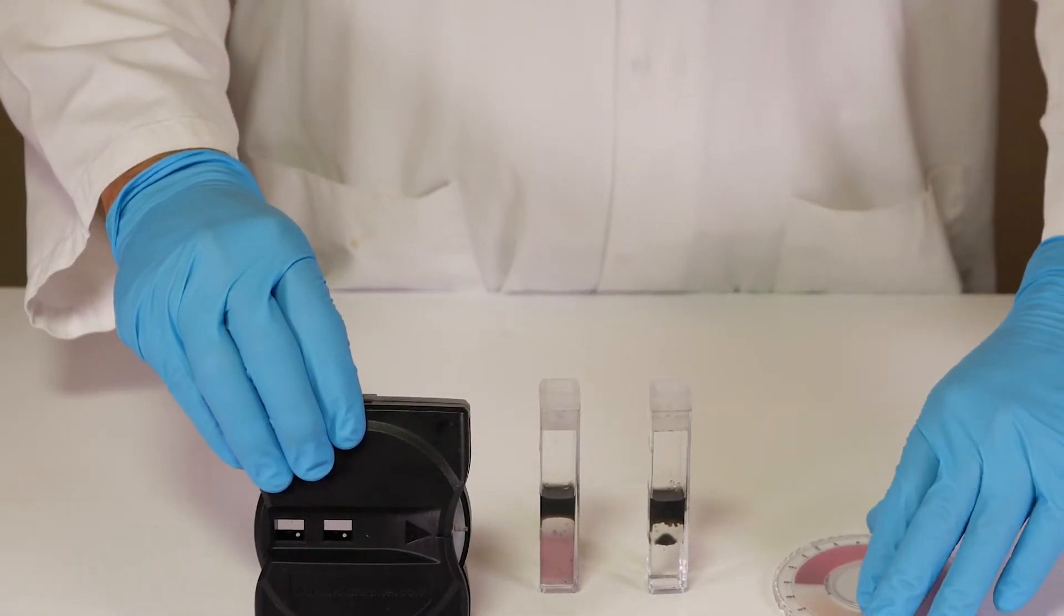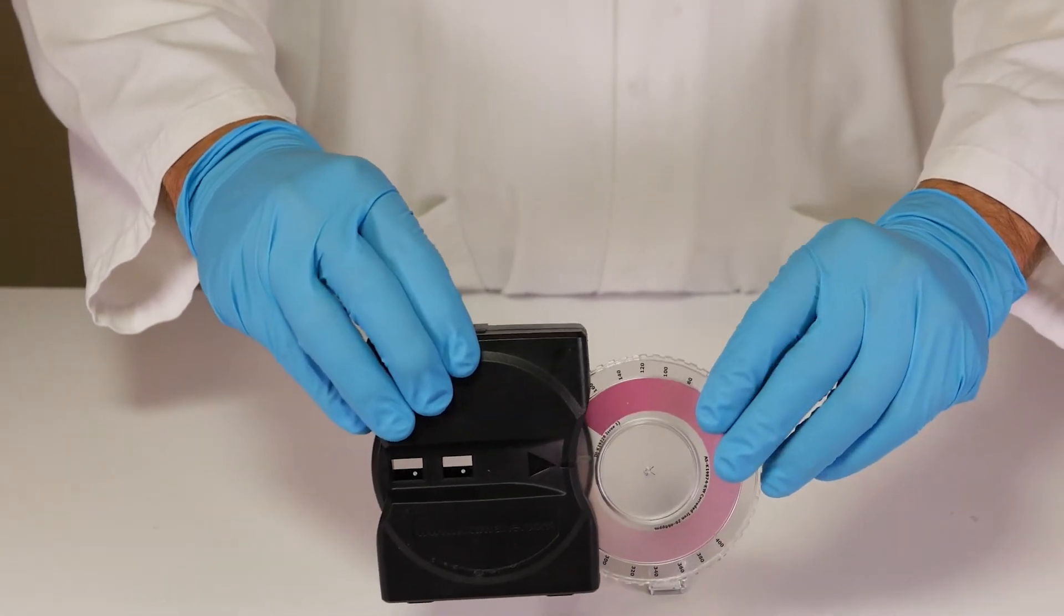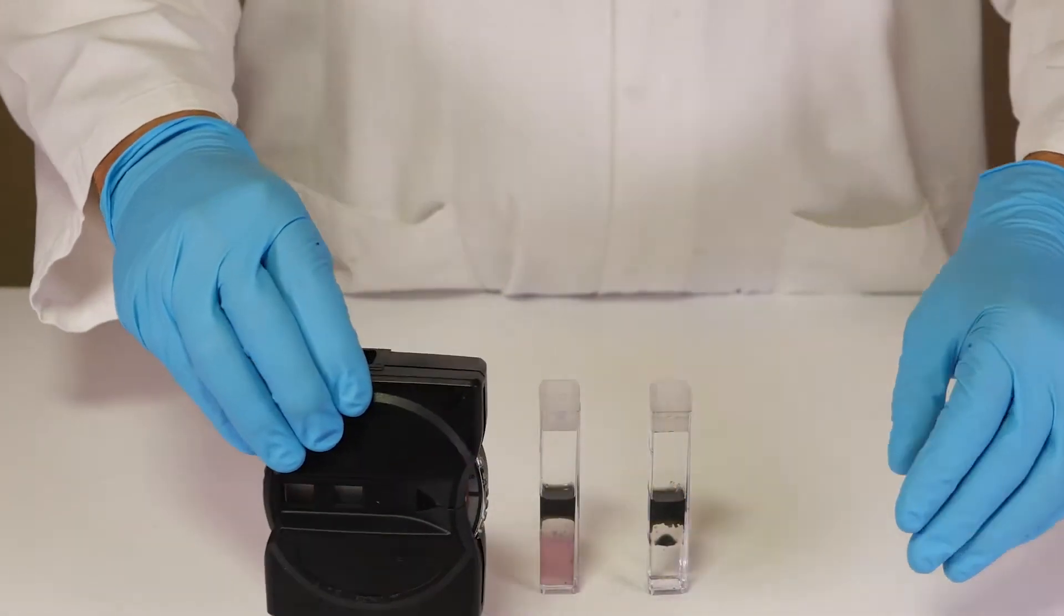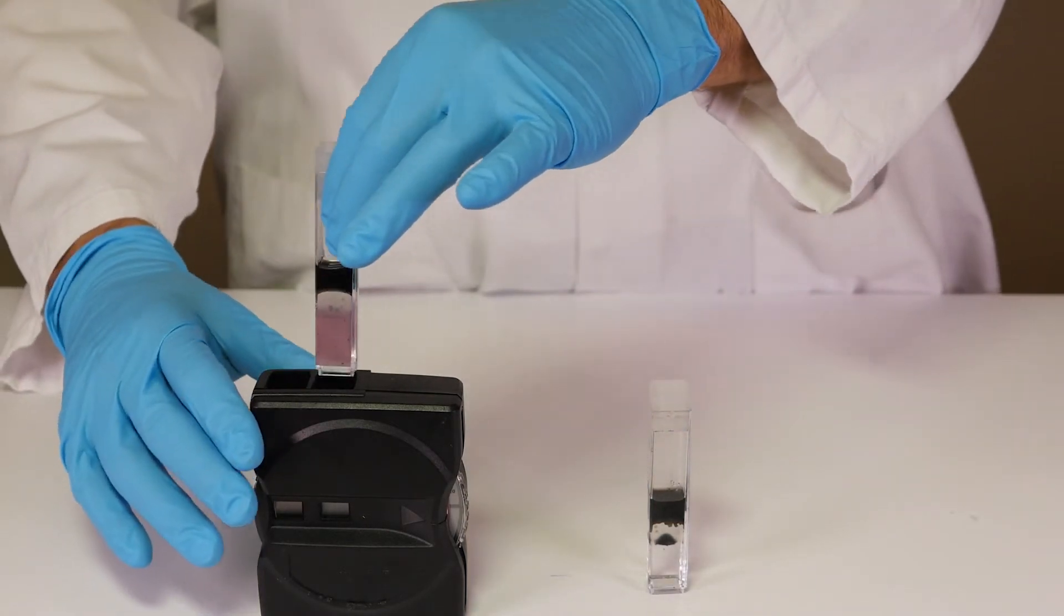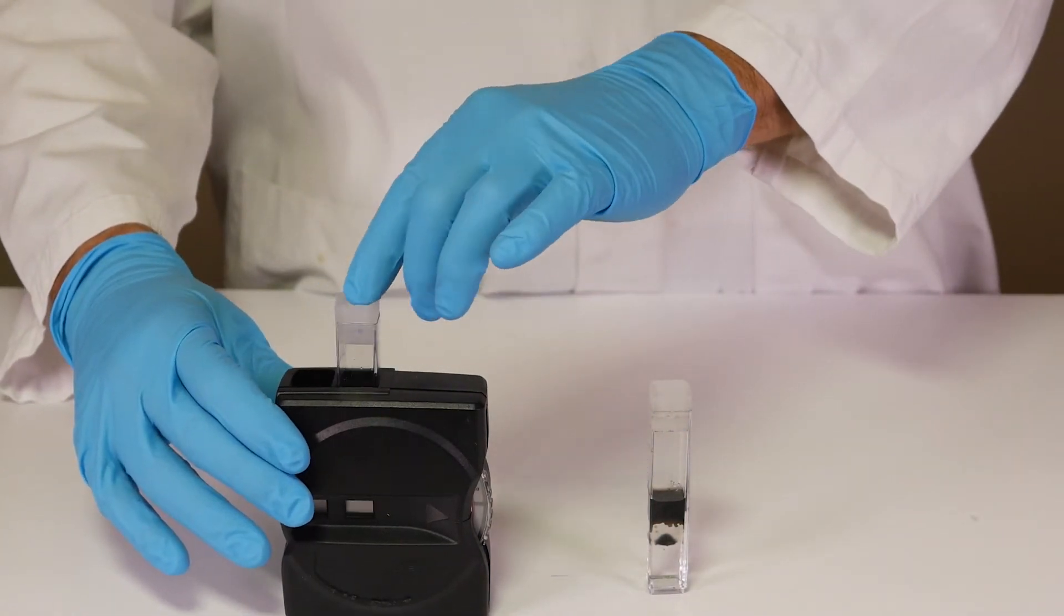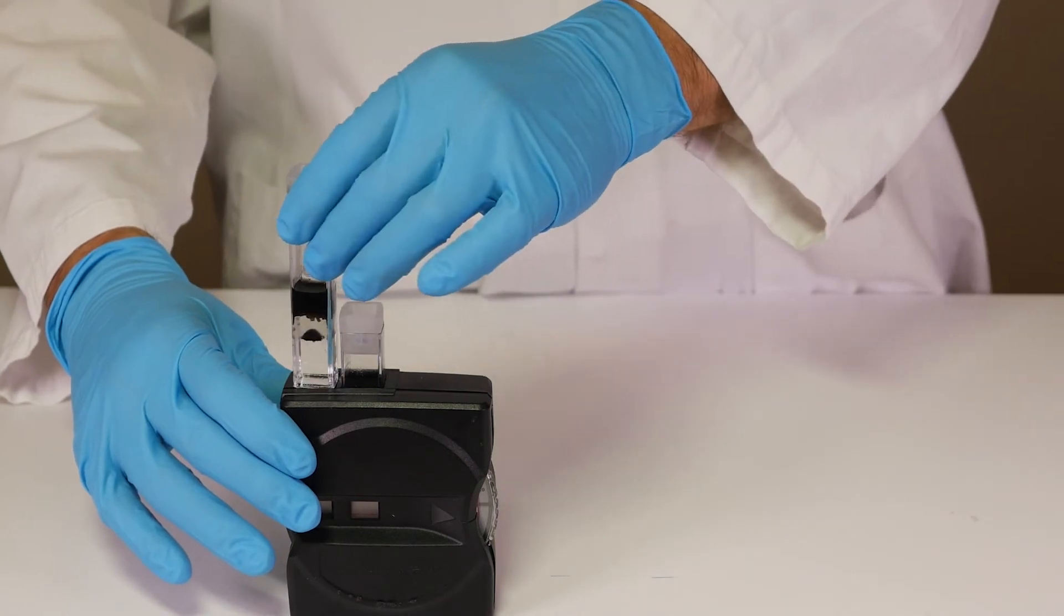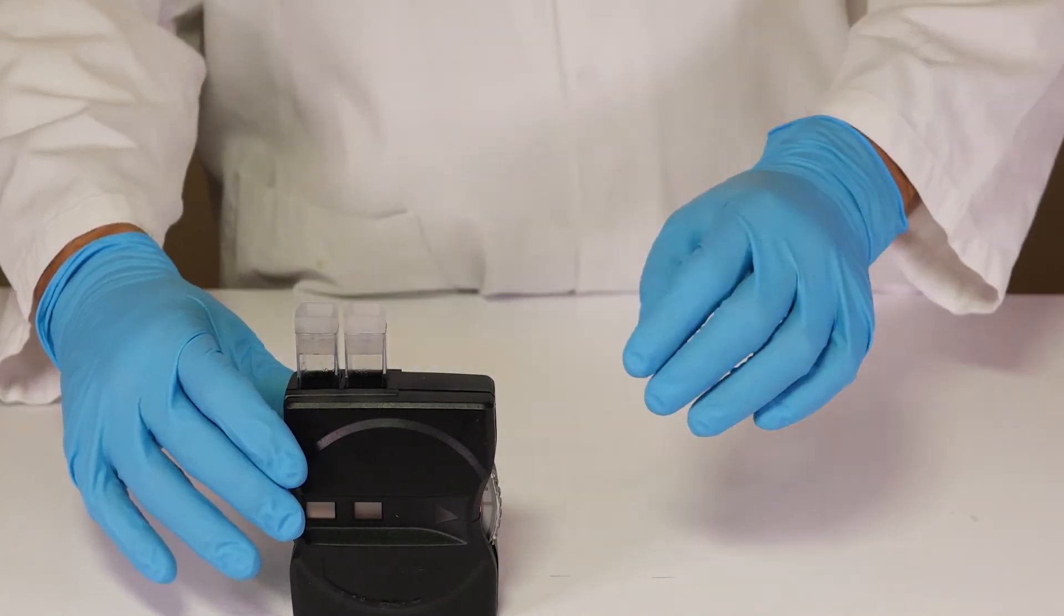Insert the colour wheel into the comparator. Place the cuvette containing reagent two into the centre most slot, and the cuvette with reagent three into the outermost slot.